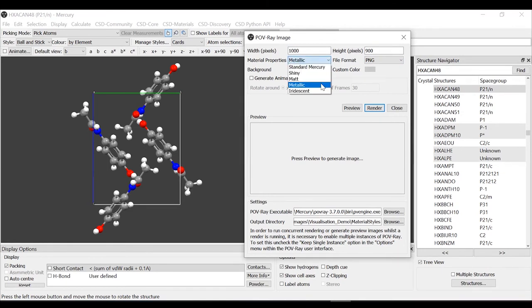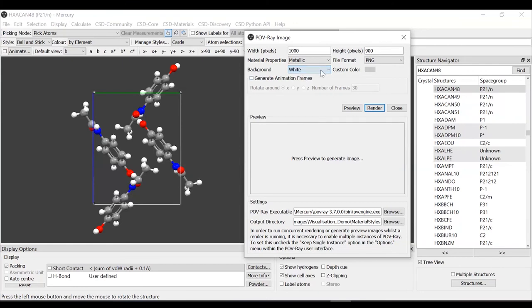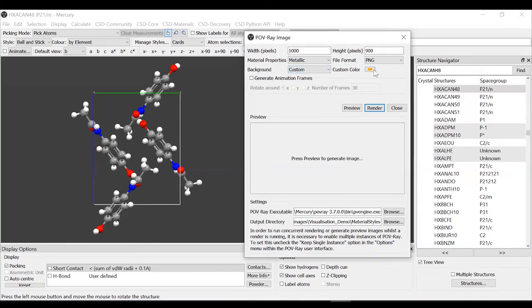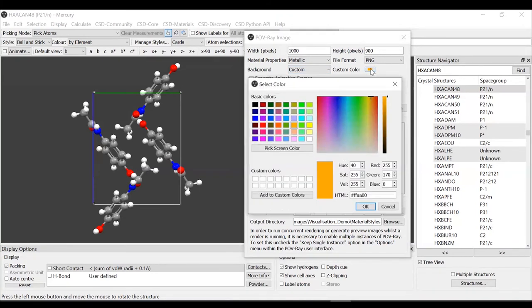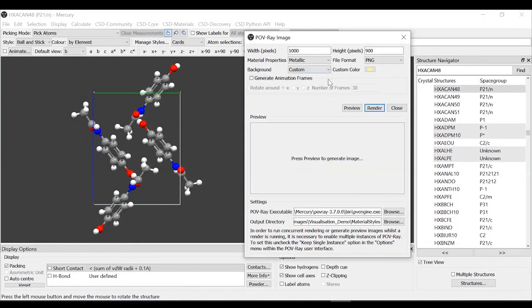You can select the file format and then you can select the material properties. For this example, I will keep a metallic representation, which is like the structure that you saw in the slides. Then you can select the background. You can keep it as the one that you have in Mercury. You can select to have it white, black, transparent, or you can customize it. If you pick custom, you can select the color from here and pick the color that you want.